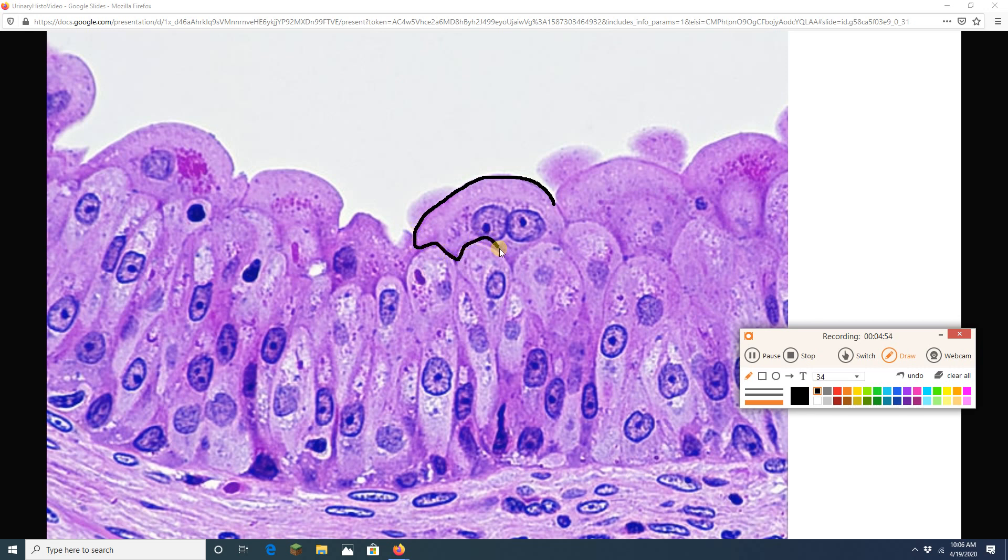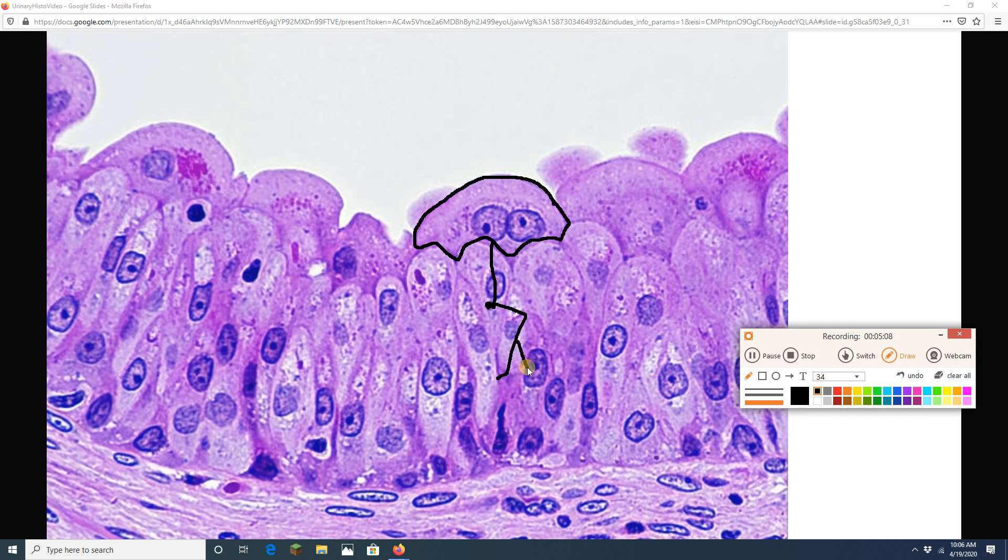This guy is binucleate which is amazing. So there is an umbrella cell right there. Just imagine there is the handle of the umbrella and then there is a person who is holding on to that umbrella. He is kind of leaning back because of the wind. There we go. He is unhappy because he is studying for anatomy and physiology class and he is in the rain. He is wearing a hat.